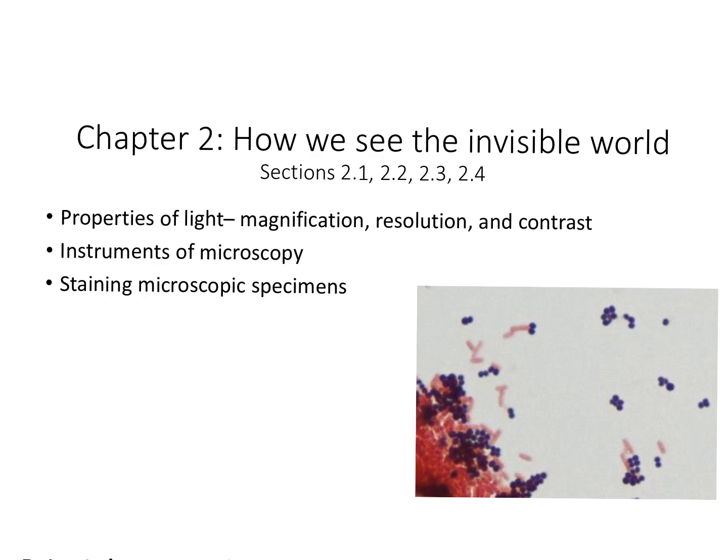All right, chapter 2 is all about microscopy. We'll try not to get too bogged down in the physics of microscopy, but there are some general terms and things that we need to understand to see our cells as best that we can. So we'll start with that.